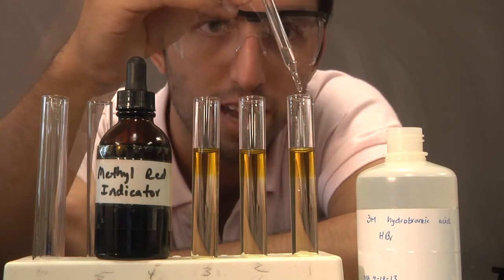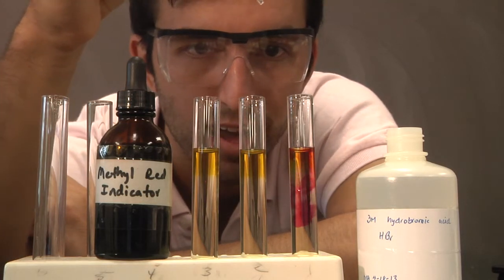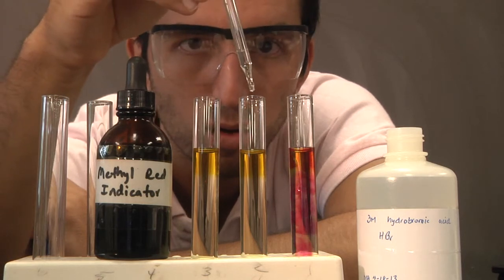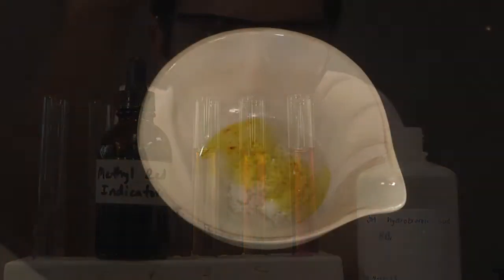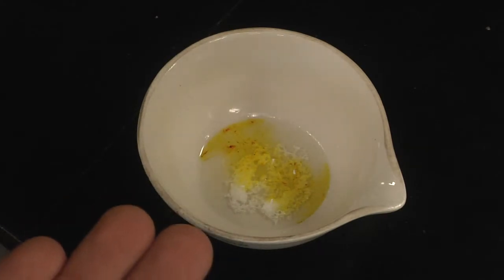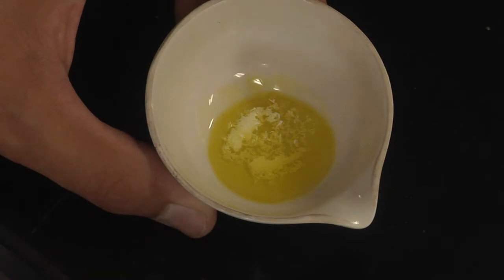If I add one drop of this hydrobromic acid, you'll notice a violent transition into a more reddish color. Methyl red is an indicator that changes color as the acidity of the solution changes. If it's yellow, it's more basic. If it's red, it's a little acidic.